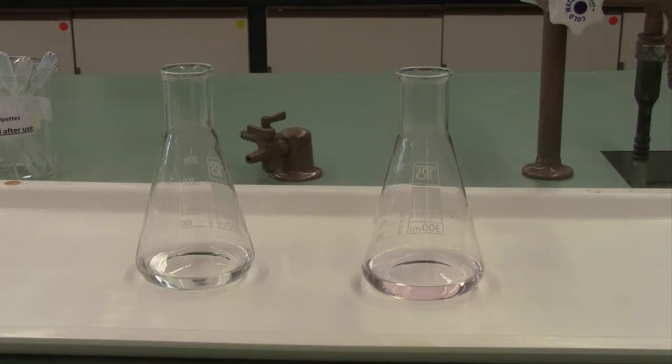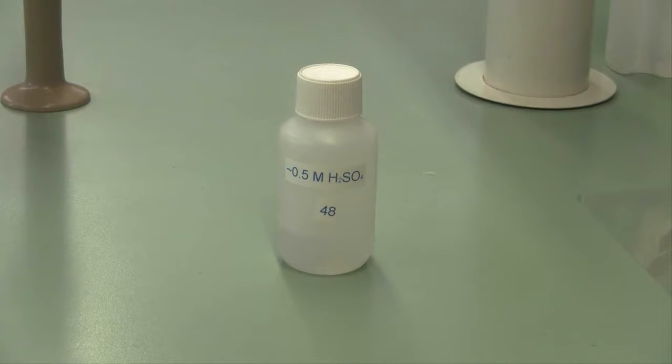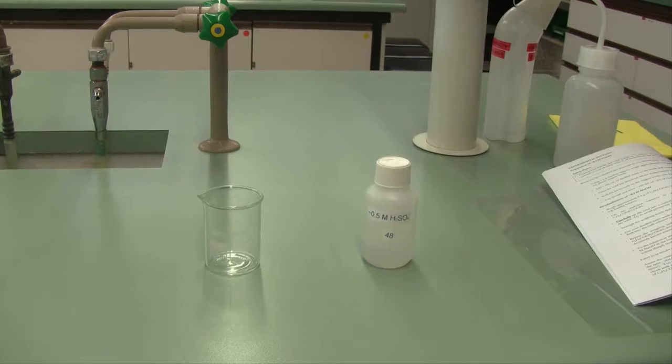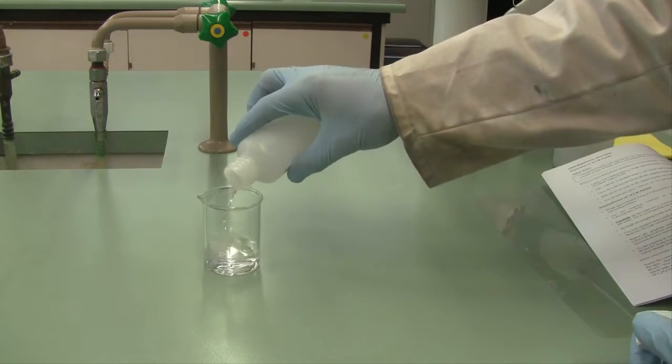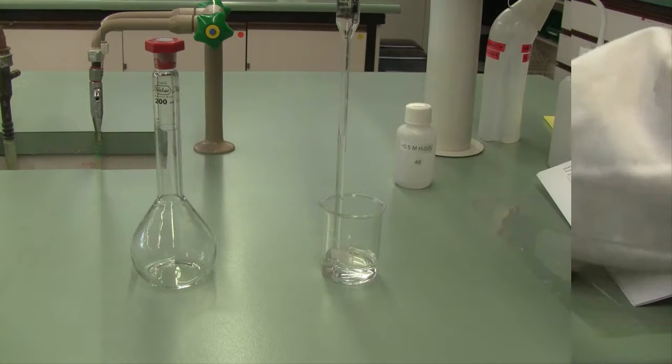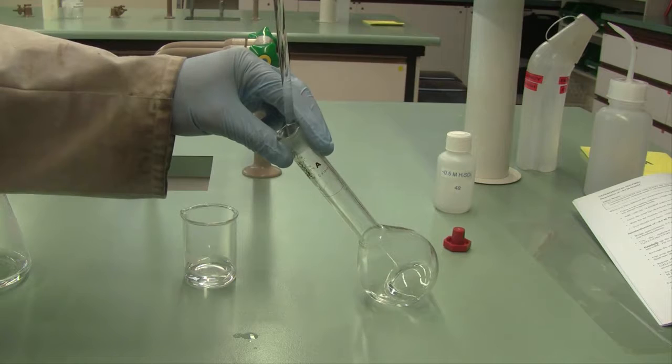Now that we've standardized our sodium hydroxide, we can use that to determine the true concentration of our unknown 0.5 molar sulfuric acid solution. First we're going to need to dilute that solution. Pour some of your sulfuric acid solution into a clean dry beaker. Take a 20 ml aliquot of the sulfuric acid, following the usual rinsing protocols, and deliver that into a 200 ml standard flask.